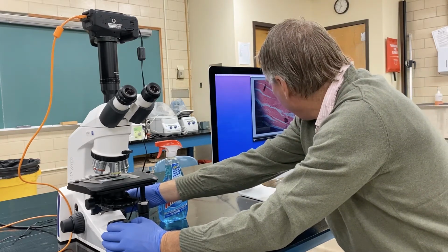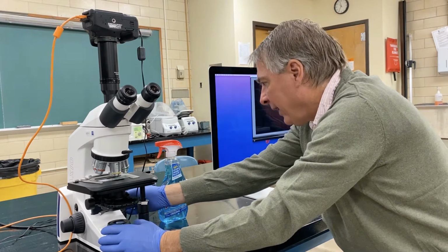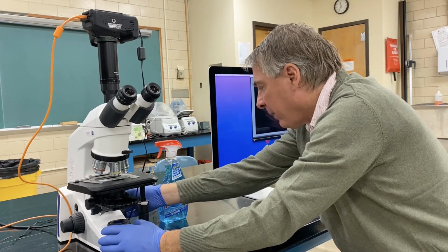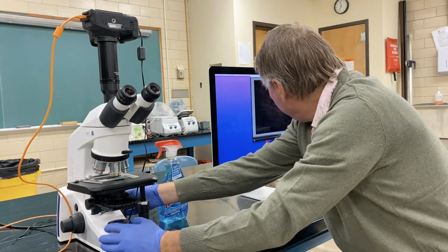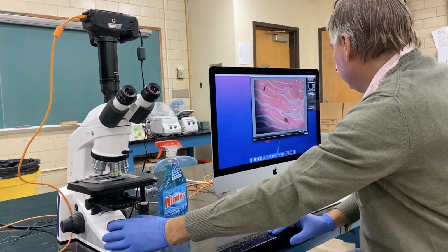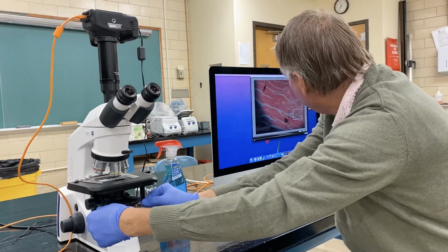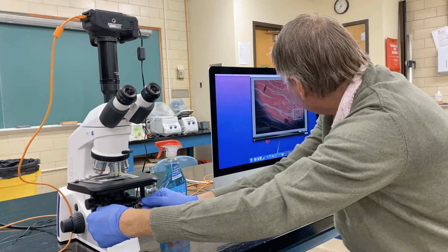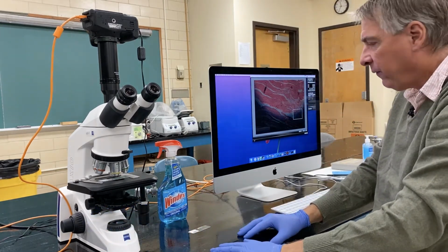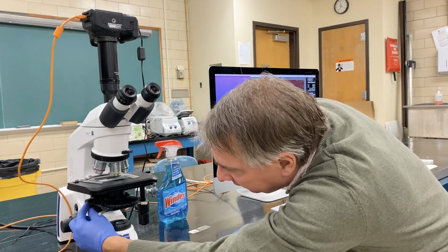I'm also going to turn down the light source power a little bit, which is controlled on the right-hand side of the microscope with a knob that's behind the focus knob. And I'm going to try to center the light again.